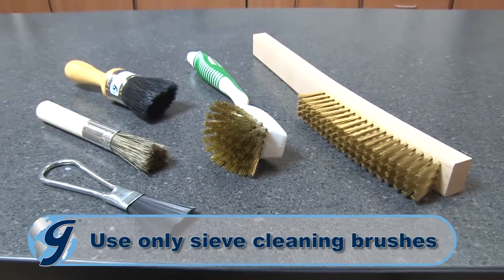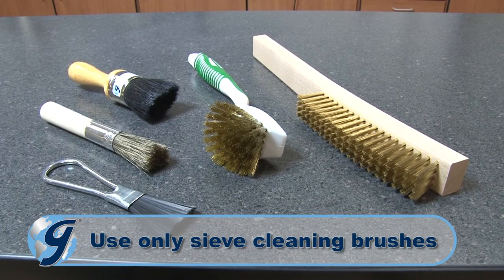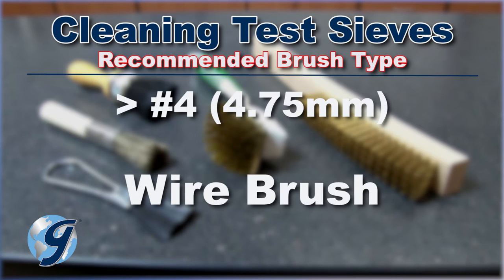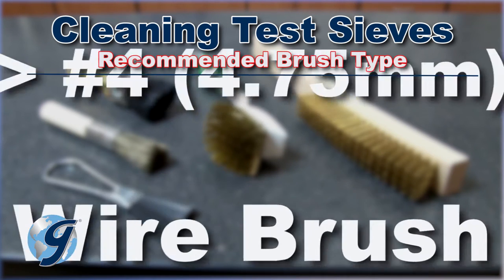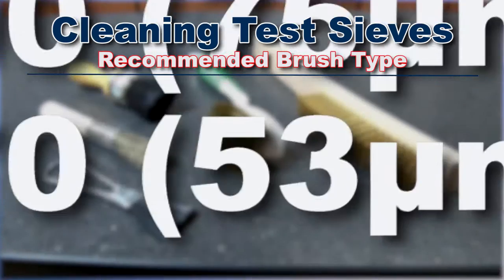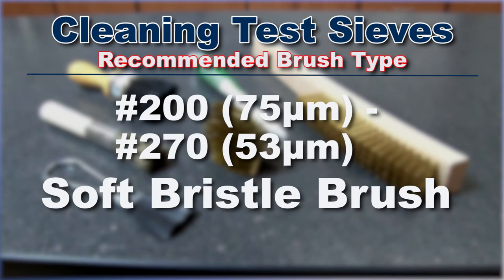Use only sieve brushes for cleaning. Sieves larger than number 4 will require a wire brush for efficient cleaning. Sieves from number 5 to number 170 are best cleaned with a medium stiff bristle brush. And for finer mesh sieves from number 200 to number 270, use a soft bristled brush.